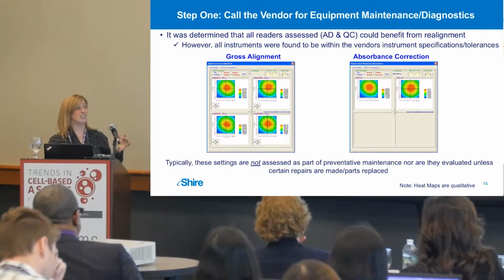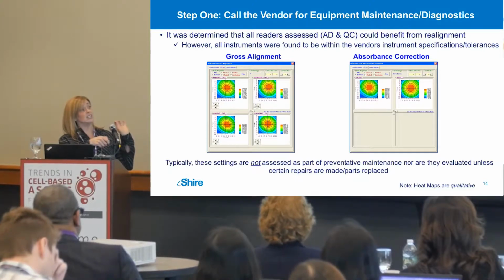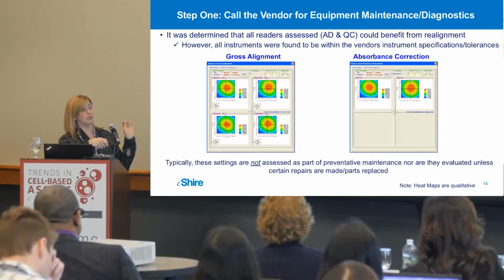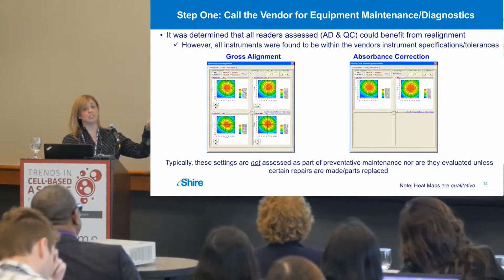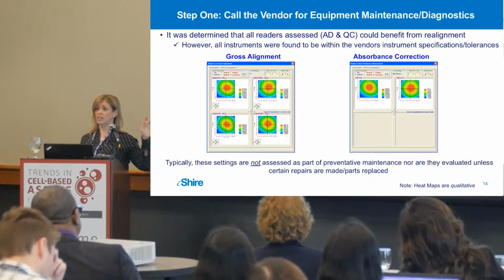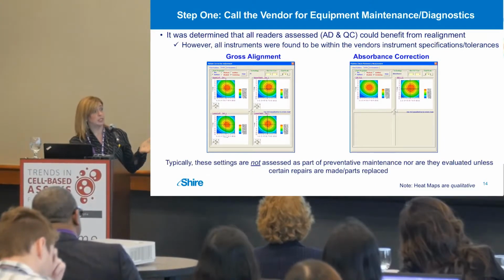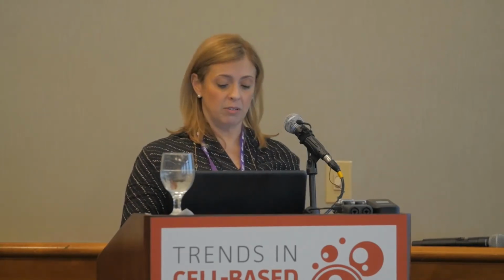Actually, the technician that came in said this wouldn't worry him. He said he does set up a new instrument with the crosshairs in the middle of the red, as you can imagine, same with this separate test. He looked at this, and they wouldn't consider anything wrong here. We're like, okay, it's not in the green, it's not in the blue. So this was fine. These are not usually assessed during a PM, because we had QC's instrument PM during this. Again, they found nothing, and they didn't really believe us.